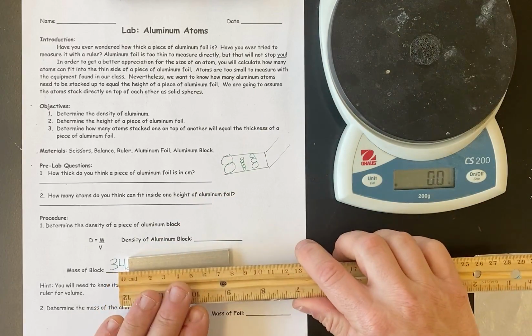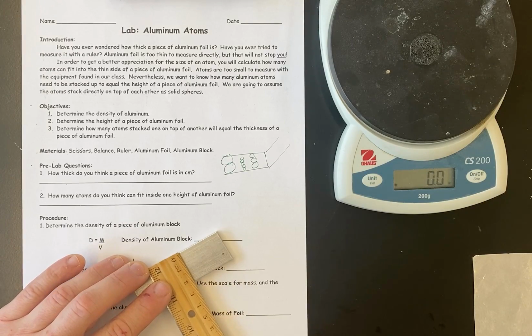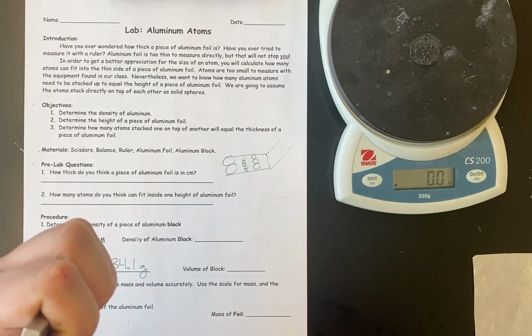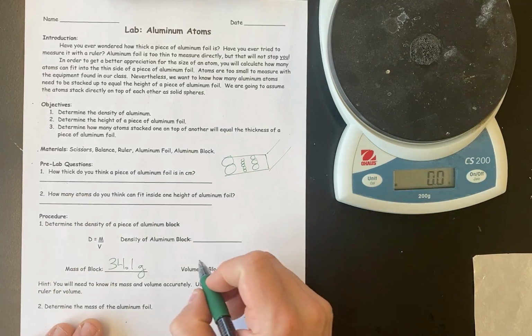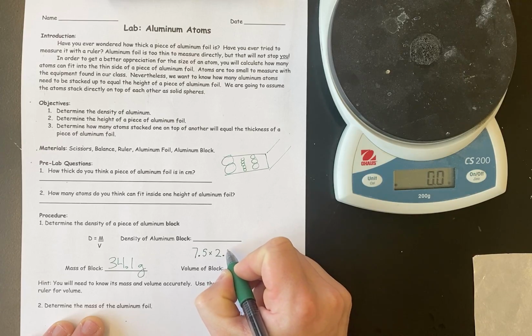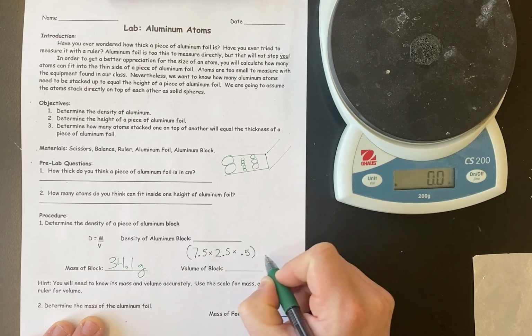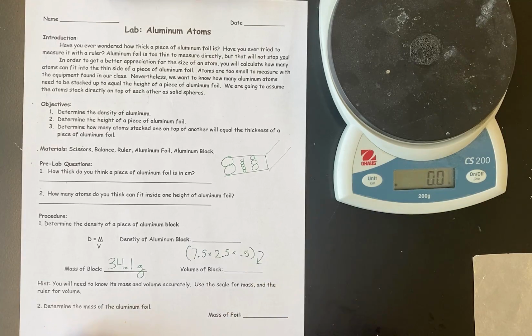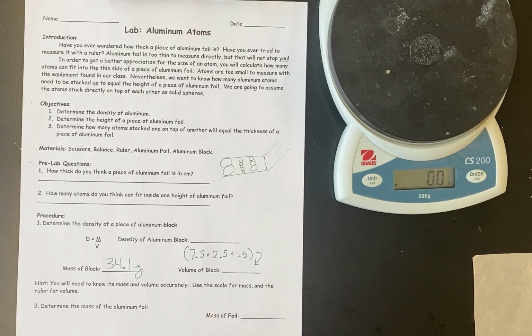And the next thing is we are going to determine the volume of the block. So the way we do that is we measure the length, then we measure the width, and then we measure the height. So you get 7.5 by 2.5 by 0.5, and that gives you the volume. The next thing you're going to do is use the density formula to determine the density and write that down because we're going to need that for the next one. We're pretty much done with the block at that point.